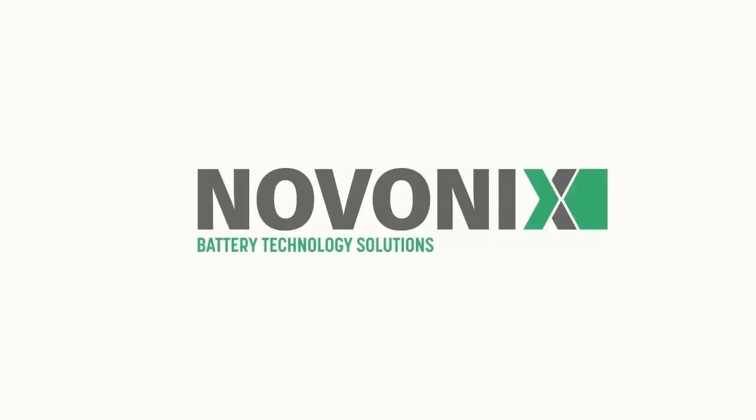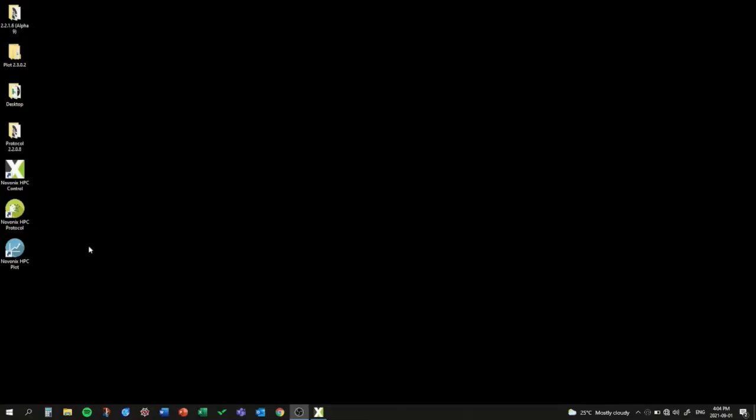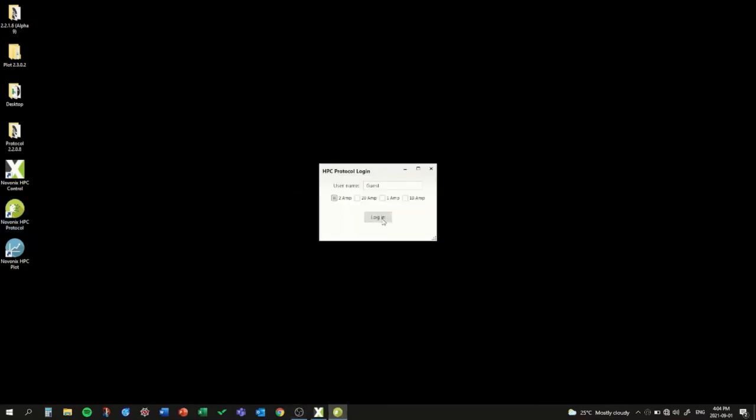In this series, we'll run through developing a protocol, running our test, and viewing the data. Let's begin. We'll start by opening the HPC Protocol software and logging in.